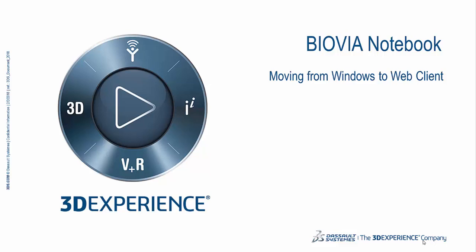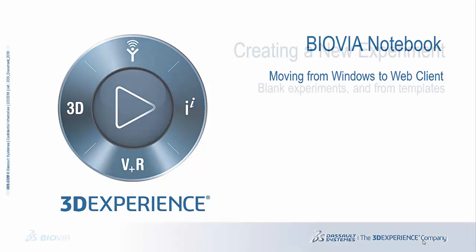In this short video, we will look at how the new web client for Biovia Notebook works compared to the old Windows client.